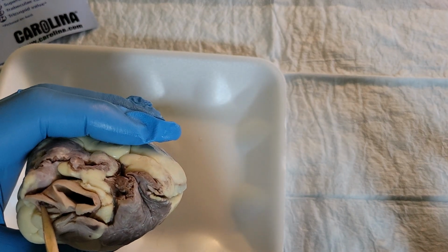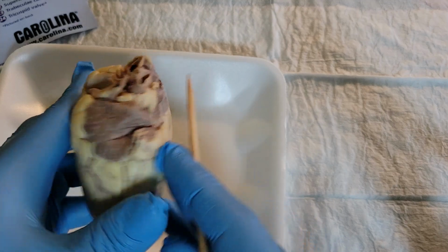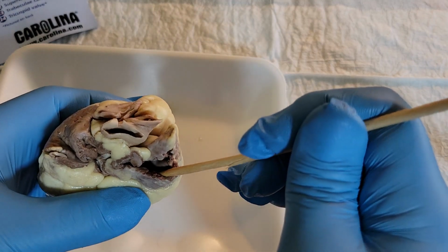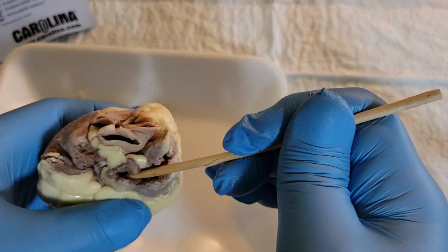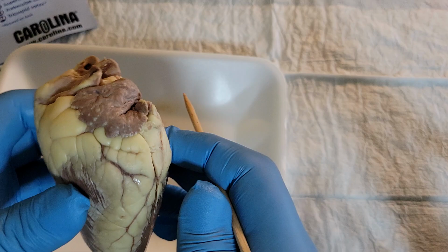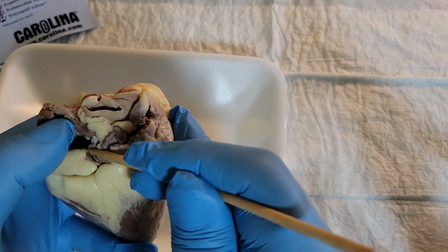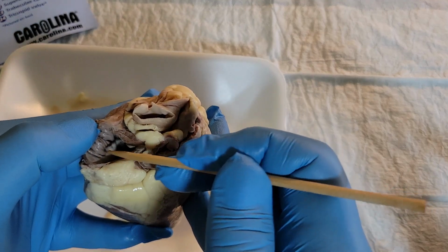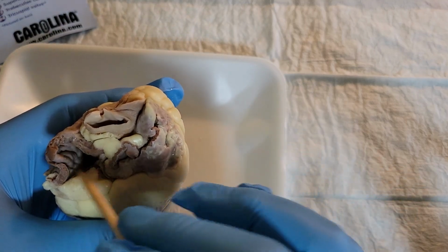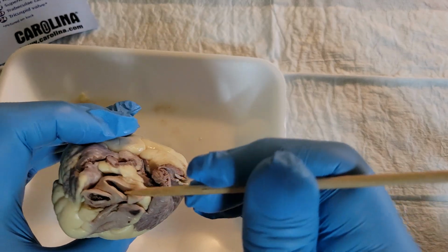The superior vena cava, which is a little torn off, would be up here, and it got cut. And the pulmonary veins, the right and left pulmonary veins would have been here, but they tore that off too in the lab, but they would be in here, and blood would flow through there. The ascending aorta is right here.